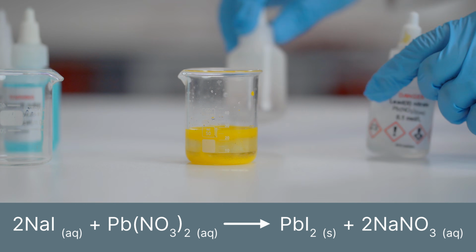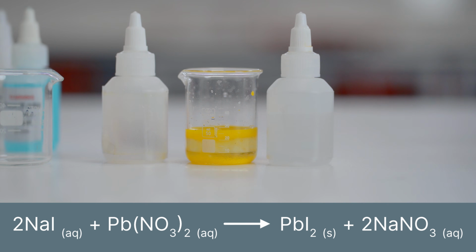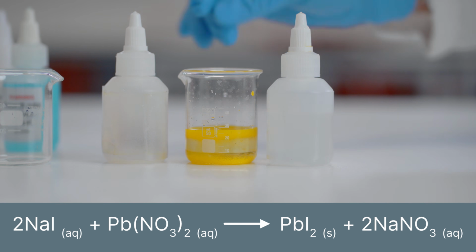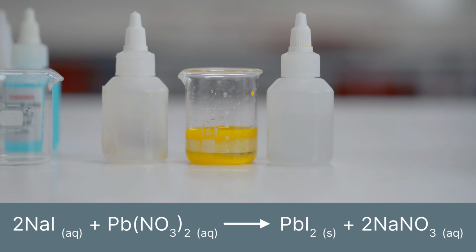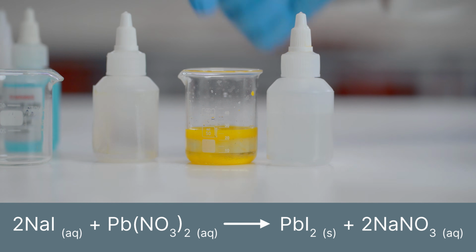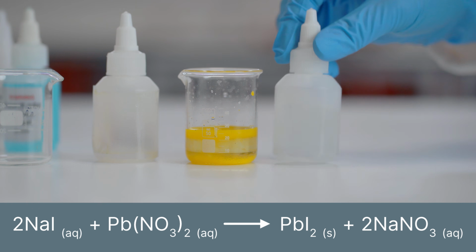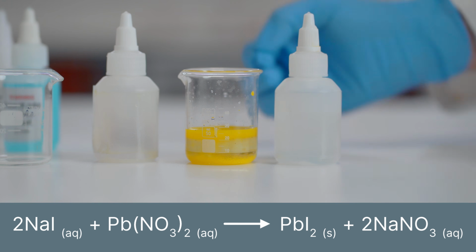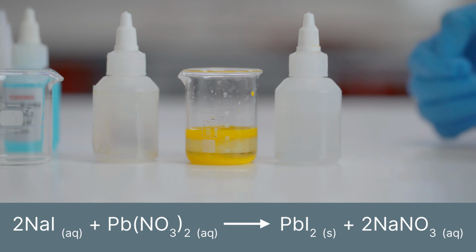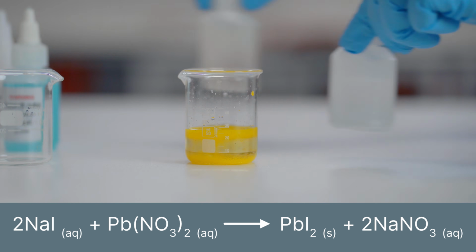I just want to reiterate to you folks at home that the chemicals that we started off with were very transparent, and what we end up with is a chemical that is not very transparent at all. It's actually a solid. Hopefully it's starting to settle down on the camera. Originally we started off with a very transparent liquid, and then I added this also very transparent liquid, and yet we have this solid being formed. Now this solid is what we call the precipitate in this chemical reaction, which will probably be lead iodide. And we'll carry on to the next one.